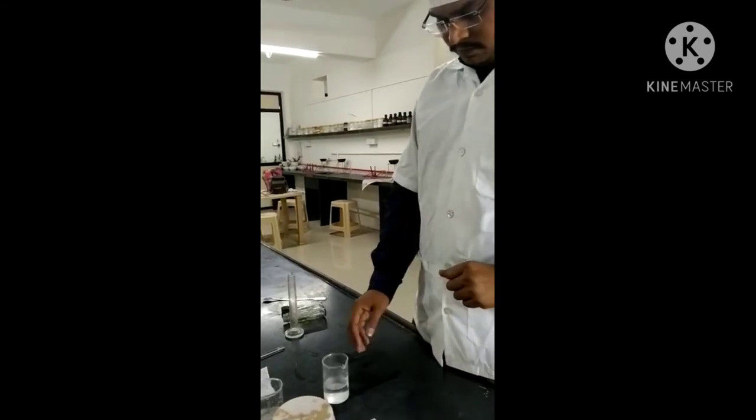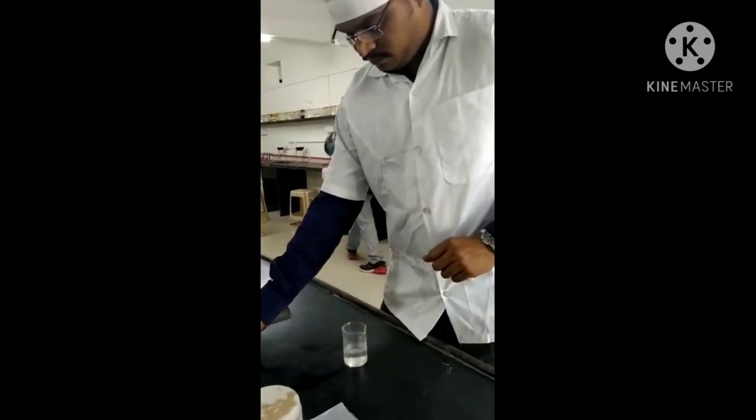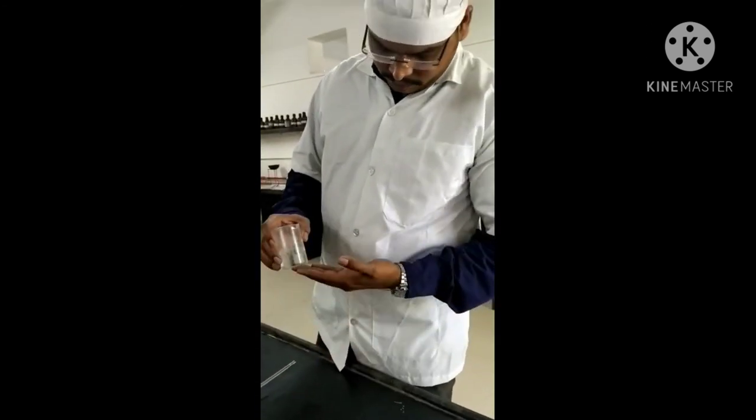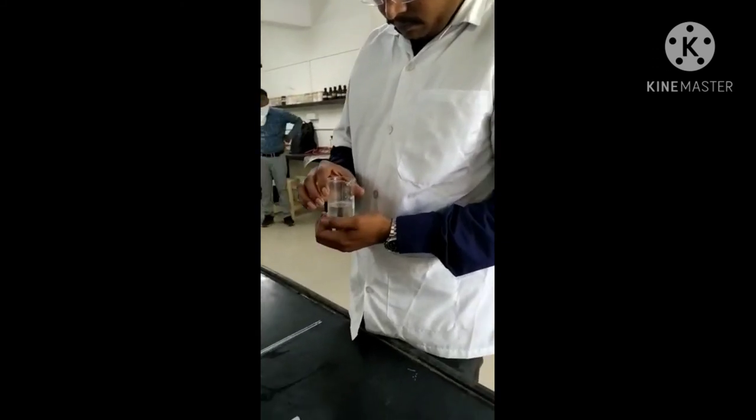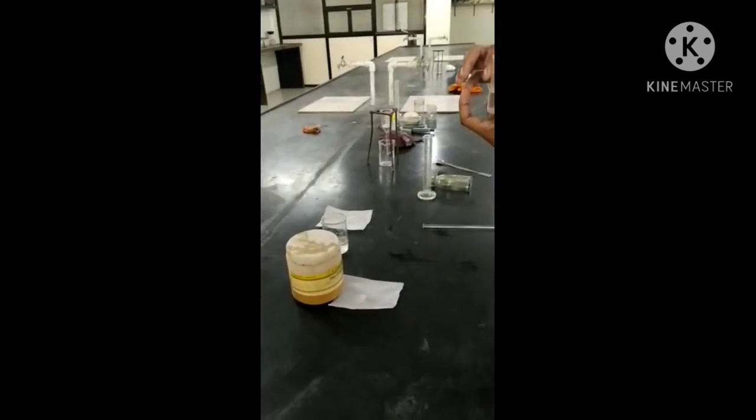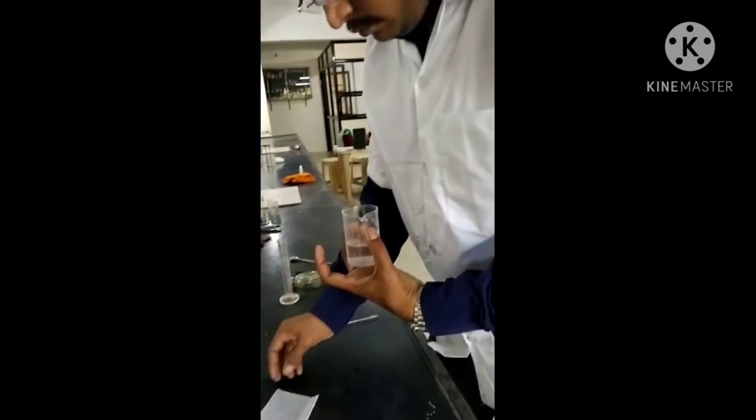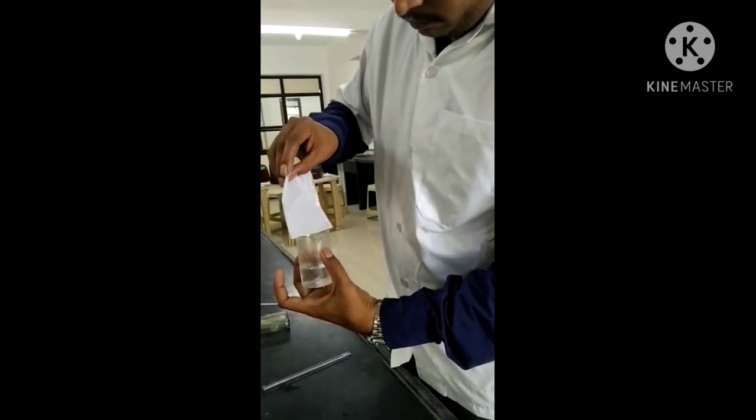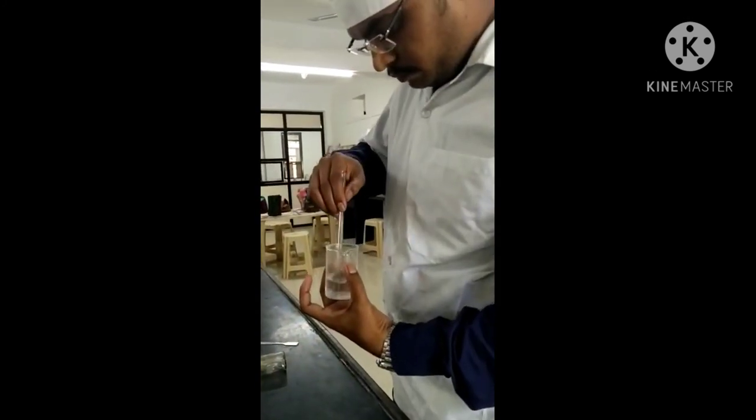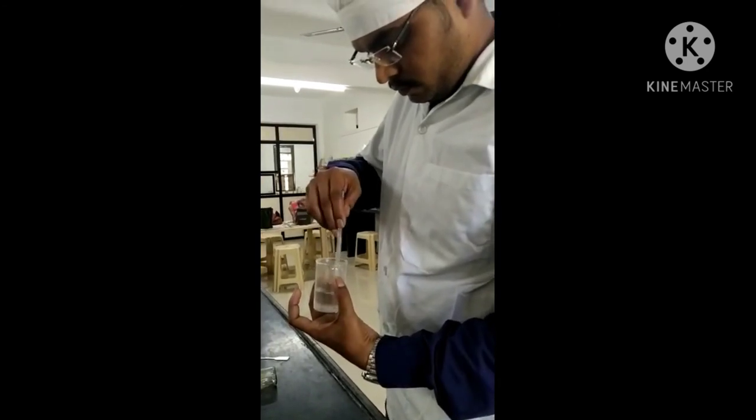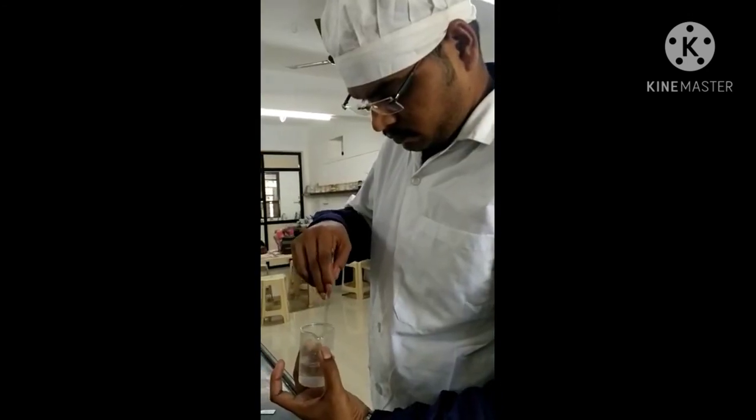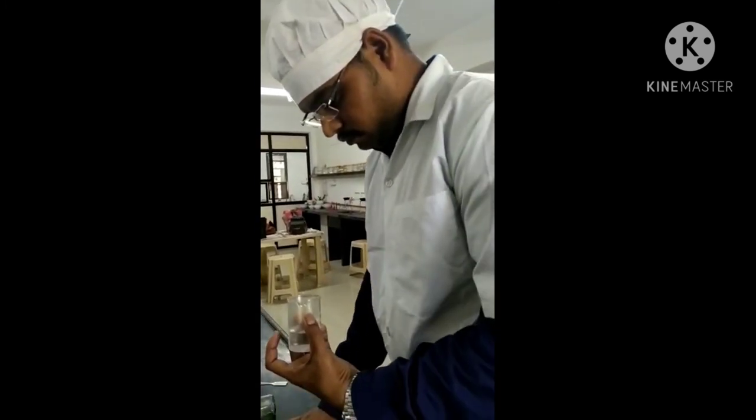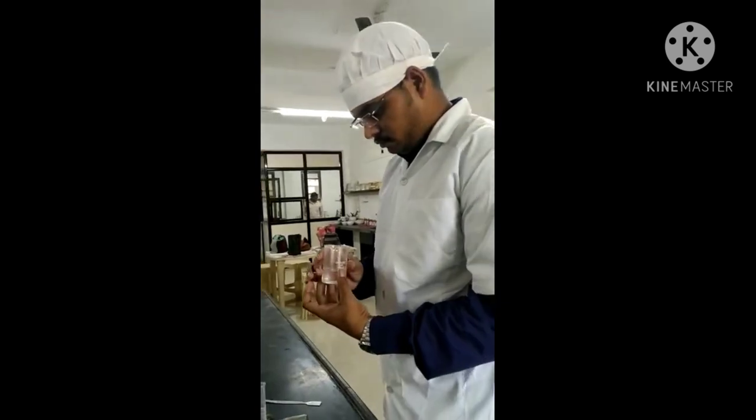Now start with the Procedure. Let's start with the Procedure of eye lotion. In that, first we take freshly boiled and cooled water. In that, we add zinc chloride and dissolve that zinc chloride in boiled water properly with the help of stirrer. After dissolution of that zinc chloride in that beaker, filter that solution through sintered glass filter.